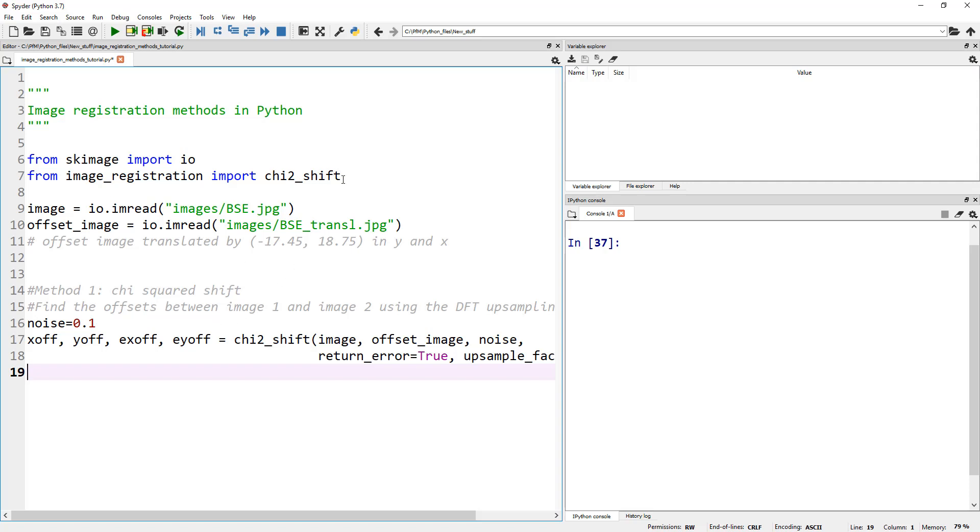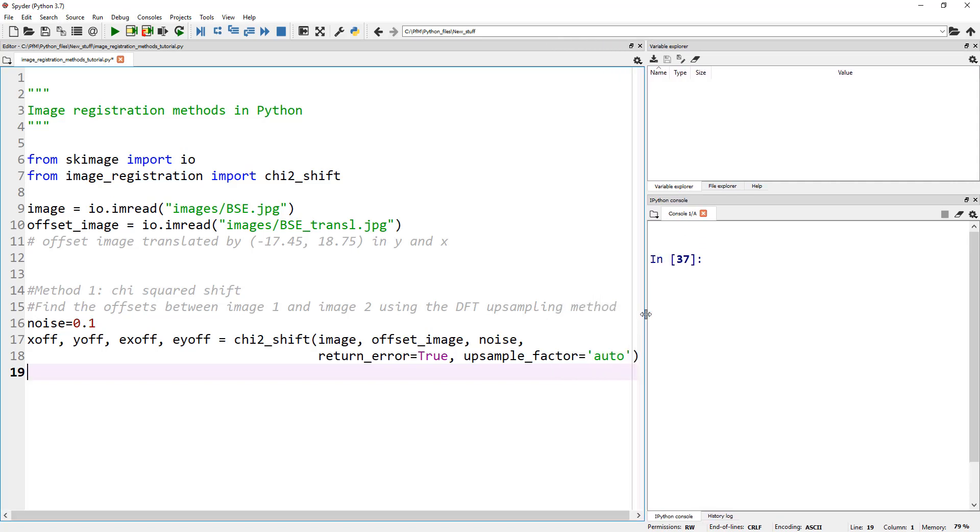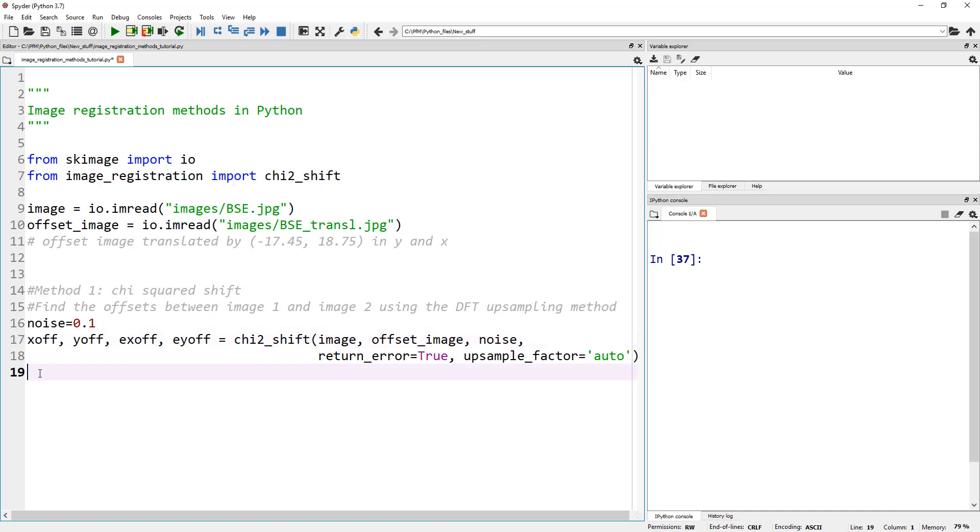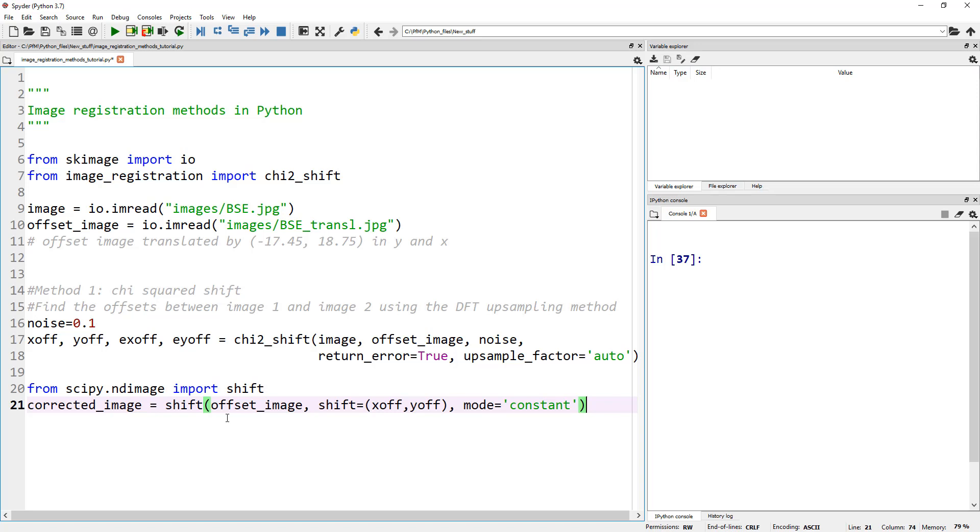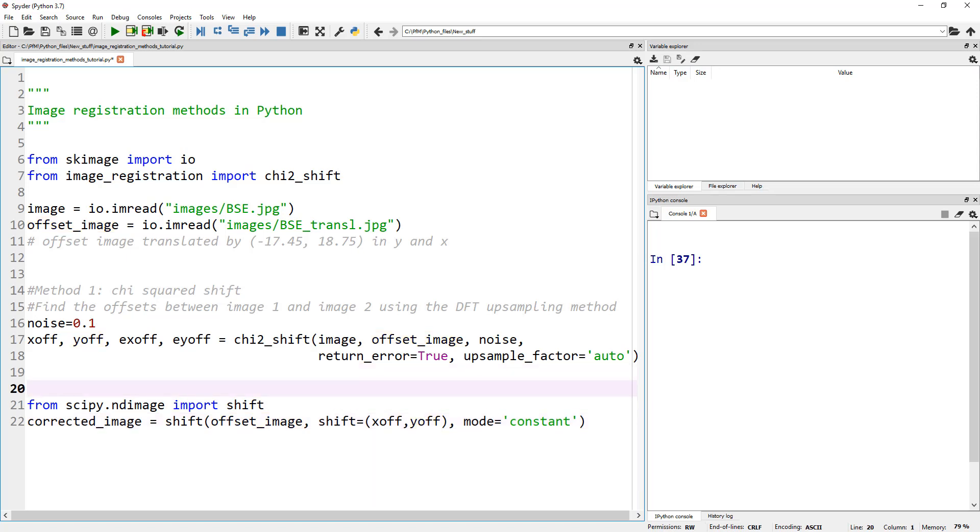The method one I'm going to show you - let's first copy this one line. From image_registration, we're going to import chi_squared_shift. The chi_squared_shift gives you four outputs: the errors and the actual offset in x and y position. Noise is a parameter you need to provide, an optional parameter. It finds the offset between the two images using the DFT upsampling method. The output we care about is x_offset and y_offset. Once you know by how much x is offset and y is offset, you can shift your second image by that much to register it with the first image.